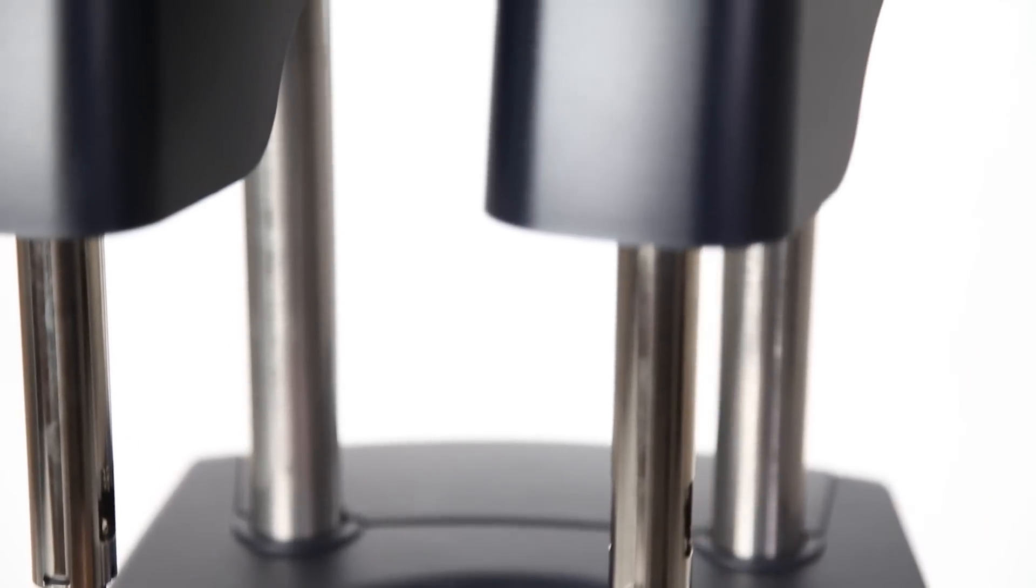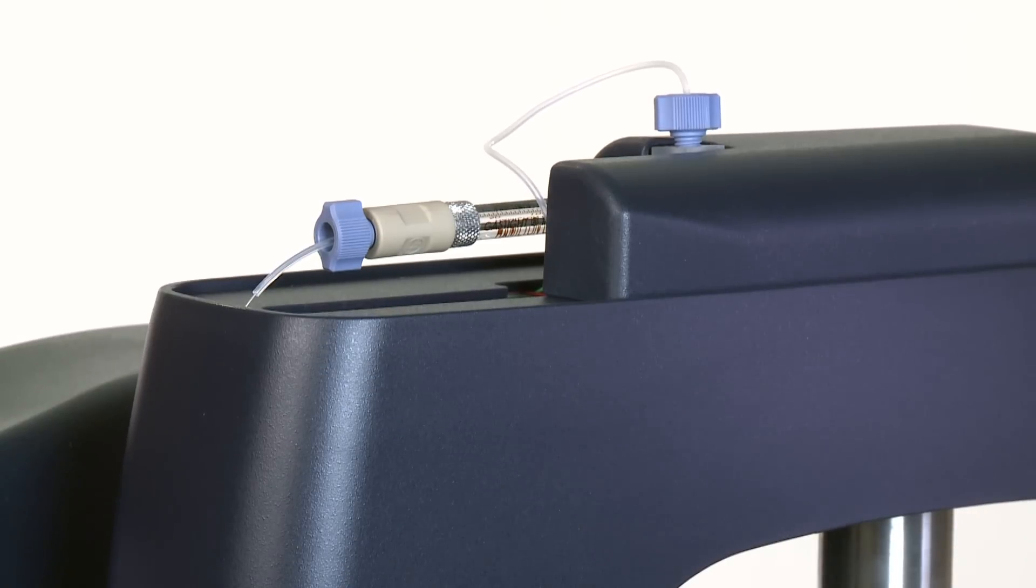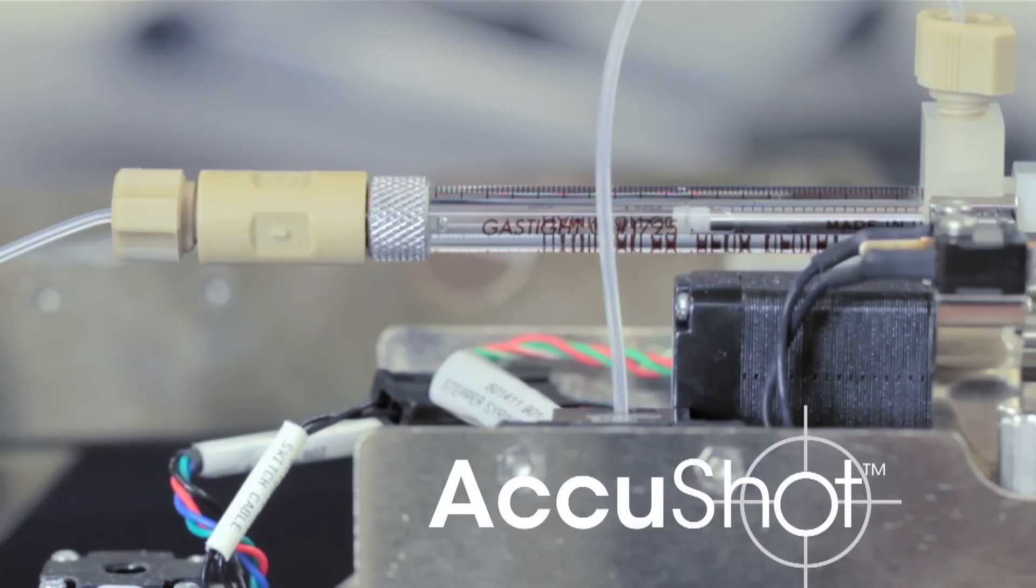The precision and location of titrant delivery are critical to obtaining the highest quality ITC data. The AccuShot injection system has been designed to optimize these factors. The AccuShot delivers the right amount of titrant in the right location at the top of the paddle for better mixing and sharper peaks every time.